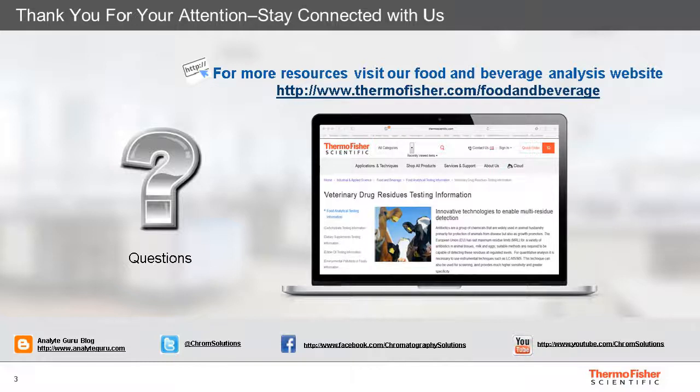So one of the problems is, if you want to do inline anion exchange trapping or concentration, then it's quite difficult to set the conditions to trap all of the analytes which we described today in this presentation. But perhaps an option that we should consider is that we could almost automate an on-guard type system where we have a pass-through column, and then we can back flush it in line.